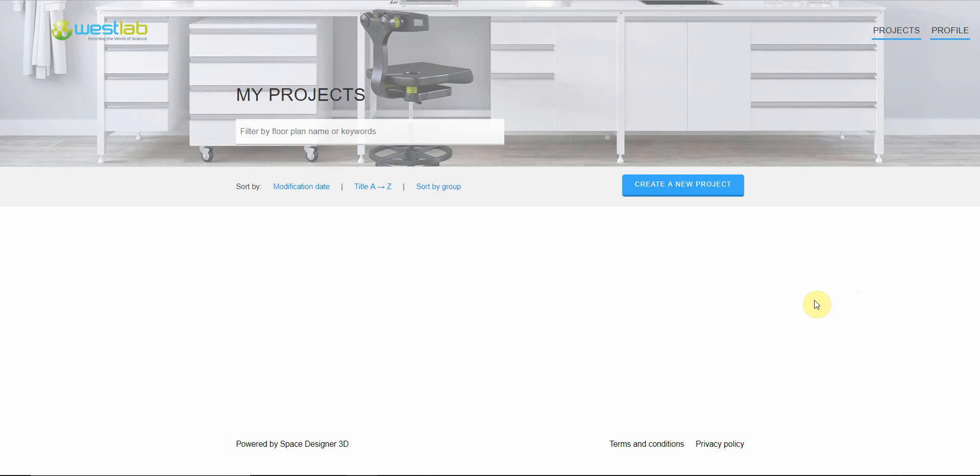Welcome to the 3D Design Tool. My name is Leah and I'm a designer here at WestLab. Once you're logged in this is your projects page which you'll be able to view any projects that you've designed.